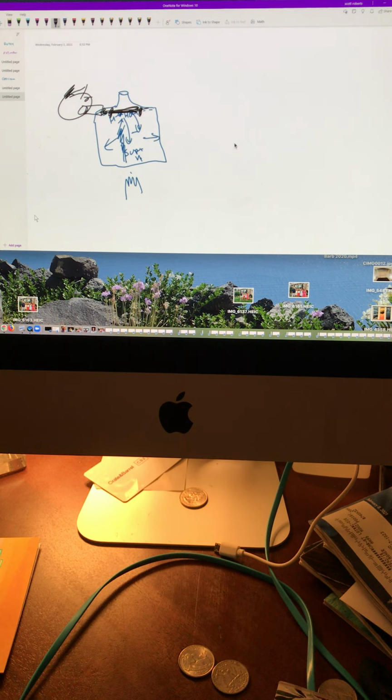What's the purpose of a boiling chip? The purpose of the boiling chip is to disrupt the surface tension. Do we understand that? You should really understand that. The purpose of a boiling chip and the purpose of an ebulator is to disrupt the surface tension. That surface tension, like I said, can heat up so hard you get superheating in the water. So you want to prevent superheating.